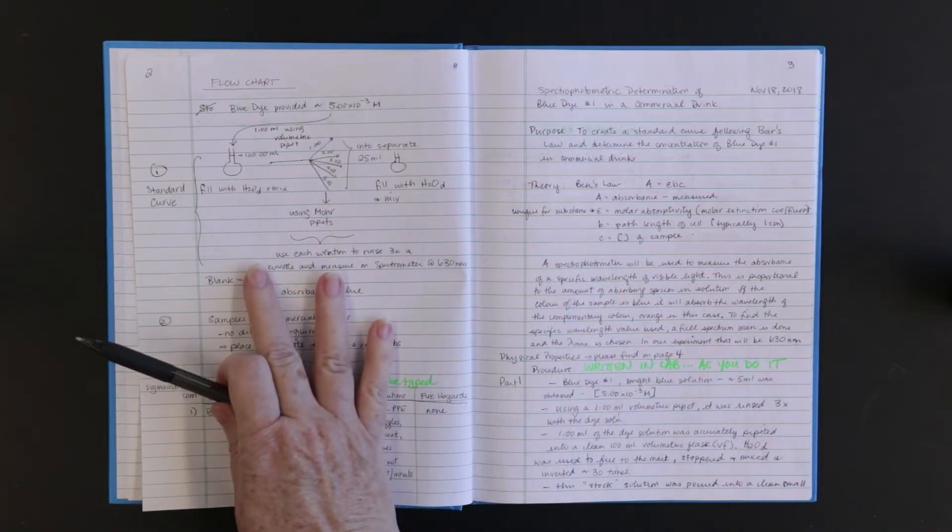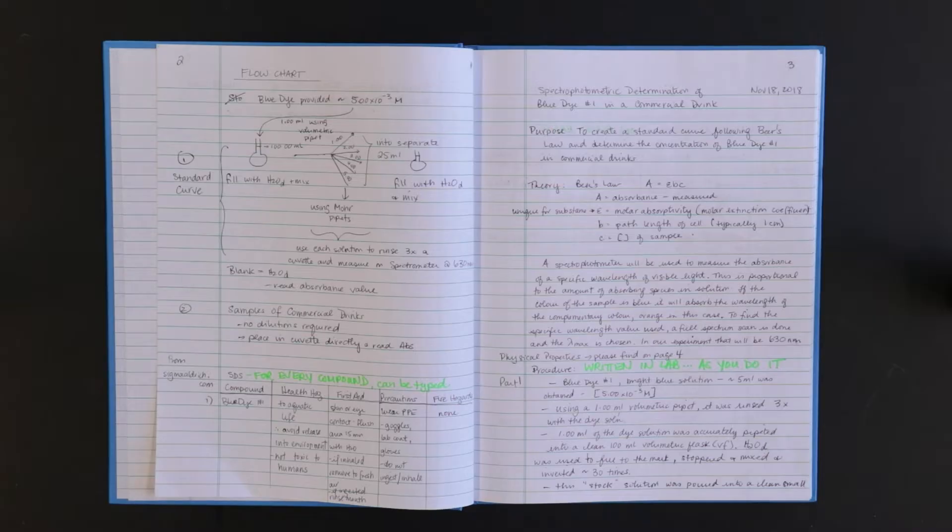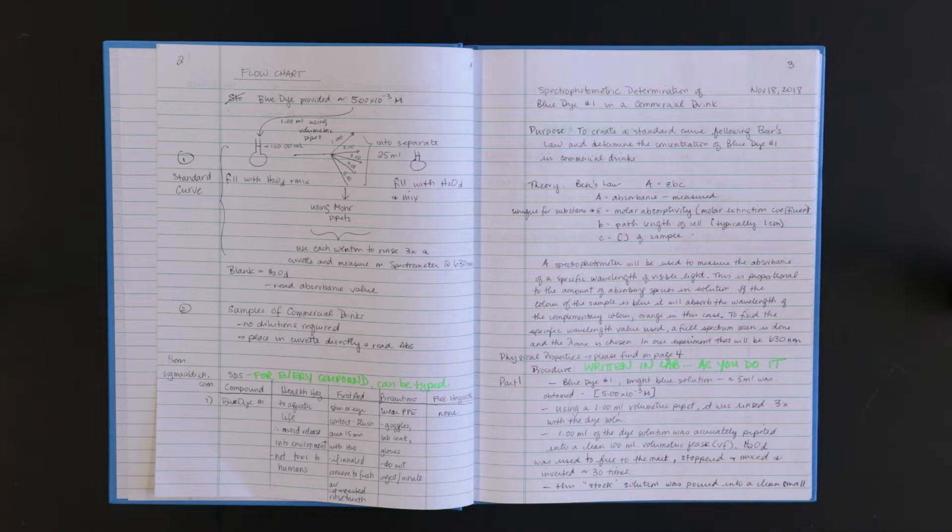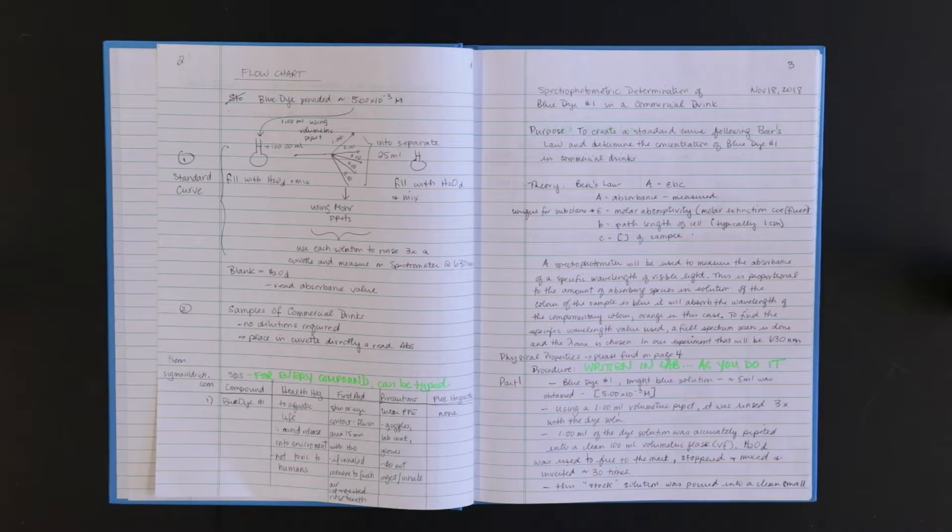On the left-hand page you need an experiment outline. This is your plan for the day. It is a summarized procedure written in point form or better yet a flow chart. You will refer to this section as you perform the experiment rather than trying to read through your lab manual.